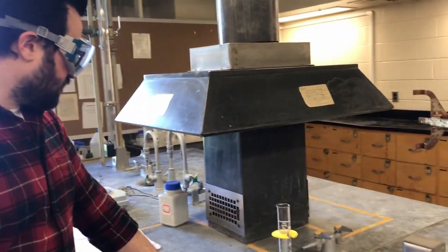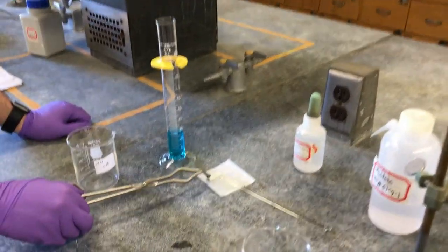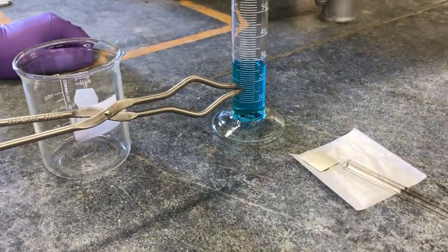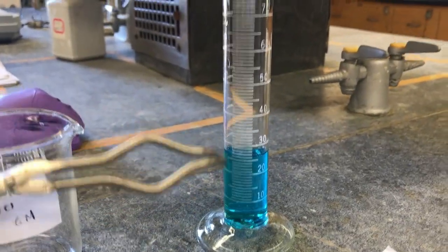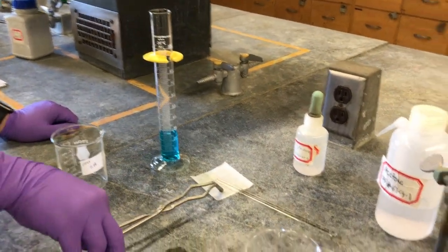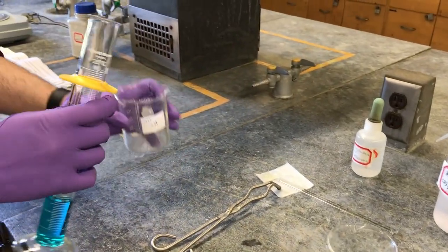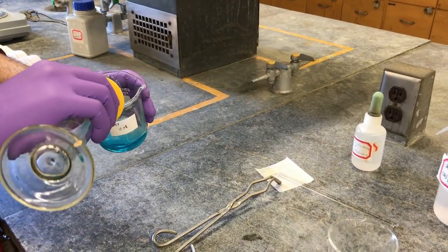So right now we're doing the empirical formula of copper chloride lab, where we have our pre-weighed zinc piece. I've measured out 25 milliliters of an 80.7 gram per liter solution of copper chloride. Our first step is to add the 25 milliliters of the copper chloride carefully to a 250 milliliter beaker.